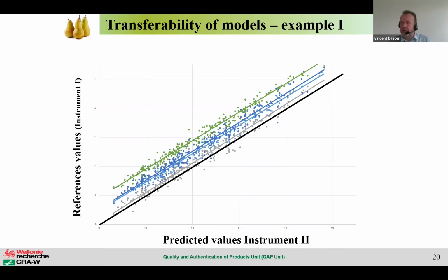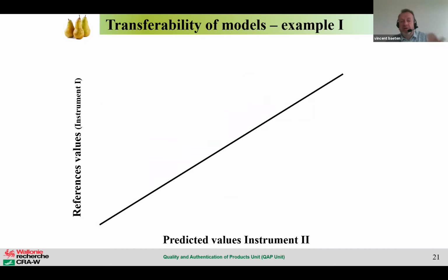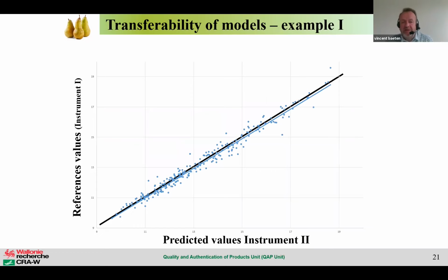When we have such a result using one equation built with one instrument and we transfer it to the other, we are quite happy because, as you can see, the problem we have is a bias problem. One of the things we can do is make a bias correction. And this is the result you get from the four instruments. So there you can be happy because all your instruments in your factory will predict the same. And that's quite important. I repeat, another important step is that year after year you still have to check if this model is still working, because you can have a new variety, you can have new conditions, you can have a drift in the instrument. You have to check.